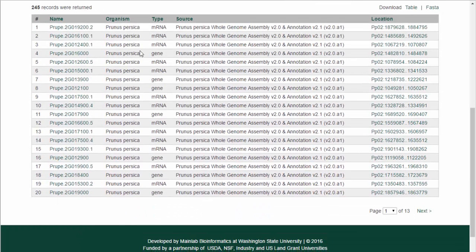More information on the results table can be found using the hyperlinks, and the table can be downloaded, and a FASTA file can also be downloaded.